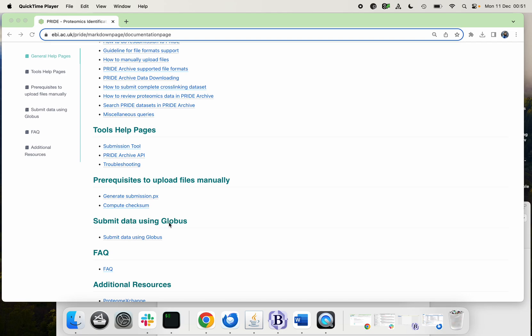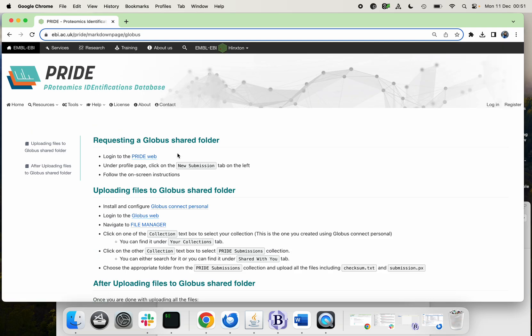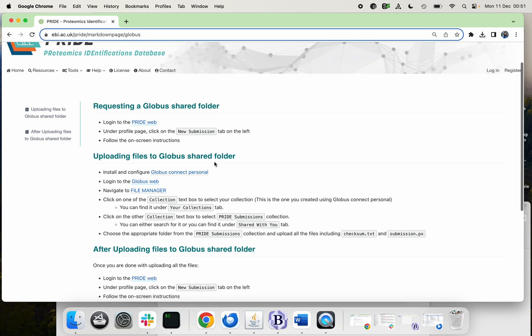Hello, this is a quick demonstration on how to submit your data using Globus. First thing you need to prepare all your files in your local machine in a directory.